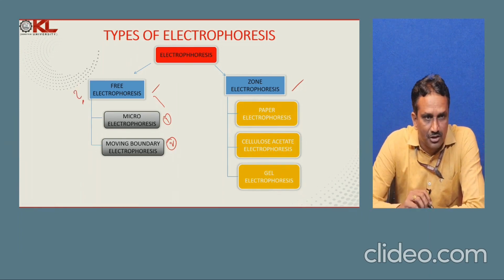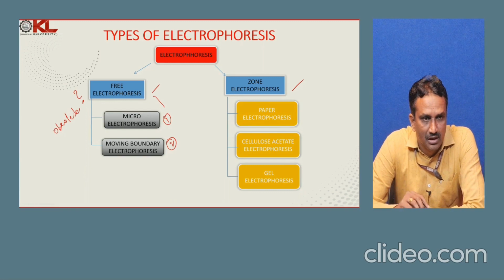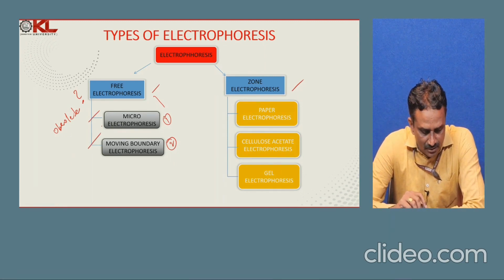However, the choice of free electrophoresis is obsolete because nowhere is this being implemented, as there are certain limitations. However, they are traditionally done.